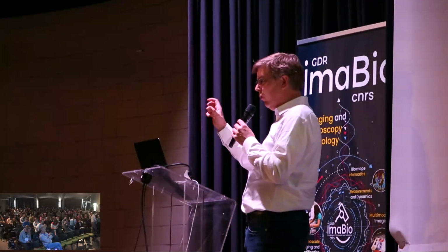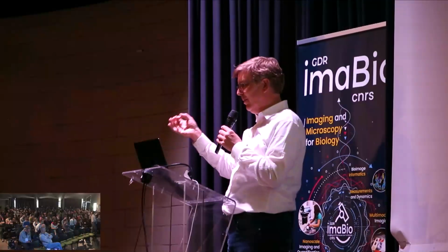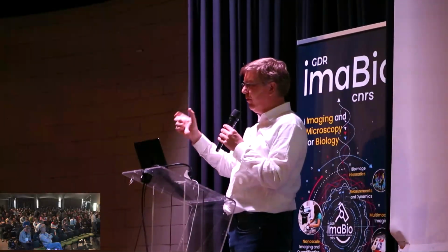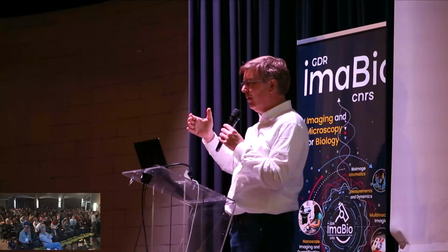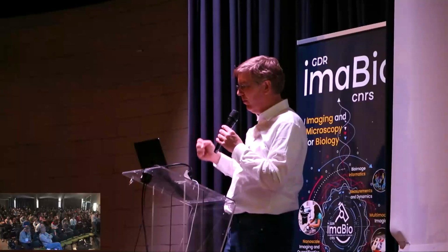You're absolutely correct. At this resolution scale, and I think Francisco will probably talk more about it because that's really important for MINFLUX, you need to consider the size of your probes, because they become the size scale of the resolution.